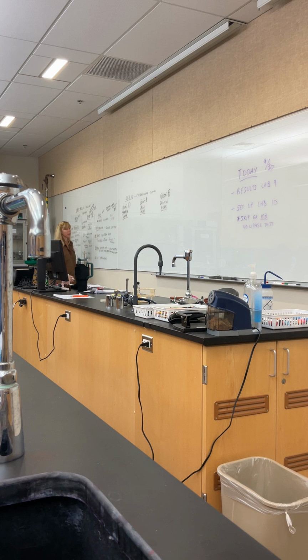Okay, just to make sure we understand what's going on. What is making the media differential, making it look different? The sugar, and specifically lactose. What is making it selective? The dyes. Excellent. So it is selective because of the dye. When you're studying these, the nice thing is that MacConkey and EMB are very similar. The only difference between the two really is the type of dyes and the fact that one has lactose and sucrose and this one has just lactose. All right, so that's really the difference we're looking for.